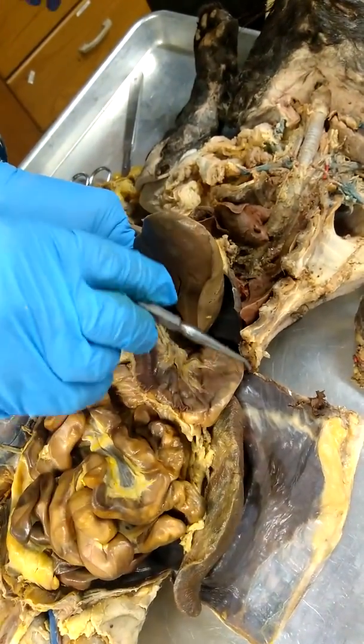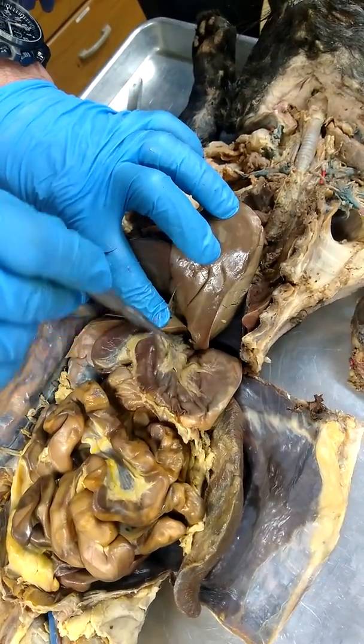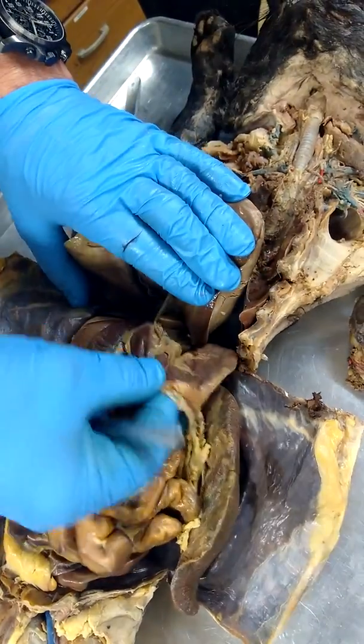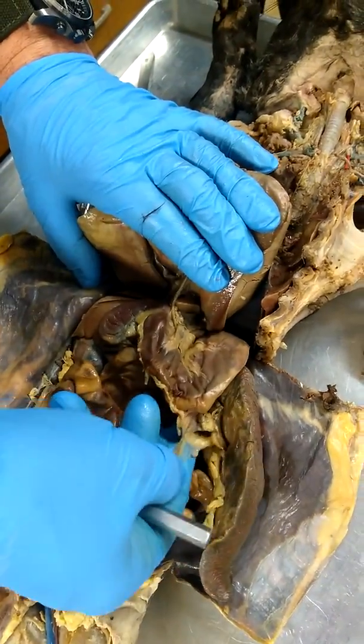region. This big curve on the outside is called the greater curvature. The smaller curve on the inside bend is the lesser curvature. Off of the greater curvature is where the greater omentum is located.